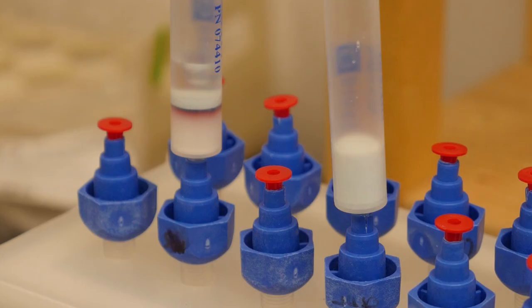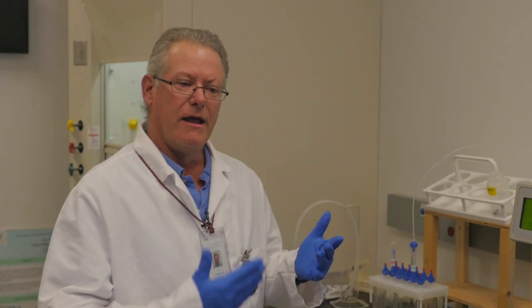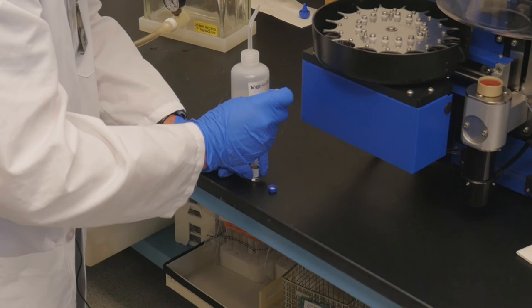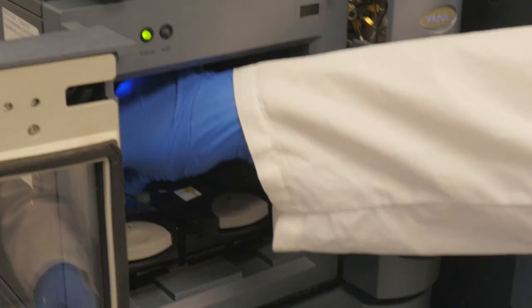So we collect water samples in the field, I bring them up to Peter and he runs them. What we do here is we extract the samples and determine whether there's human source compounds in them, such as acetaminophen, Tylenol, caffeine. Those source tracking compounds identify that there's a component of human waste in those water samples.